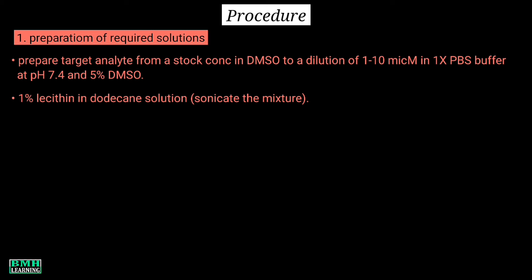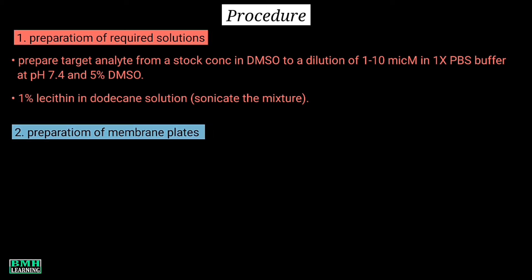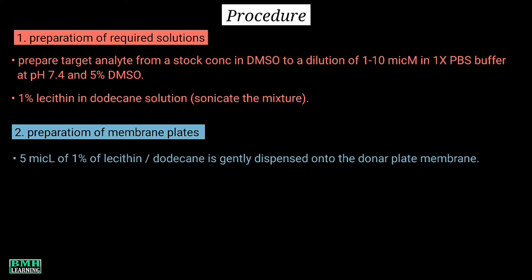Mix the contents until combined. The second step is preparation of membrane plates. Using a pipette, 5 microliters of 1% lecithin in dodecane is gently dispensed onto the donor plate membrane.